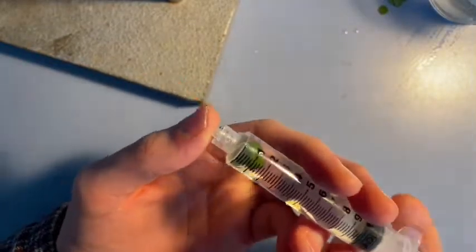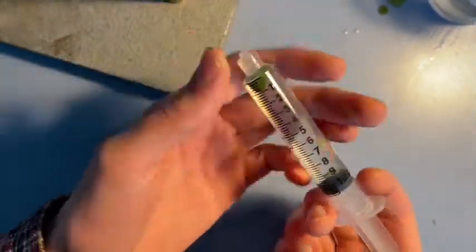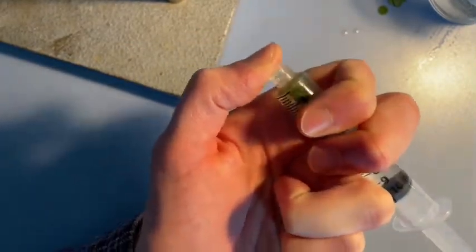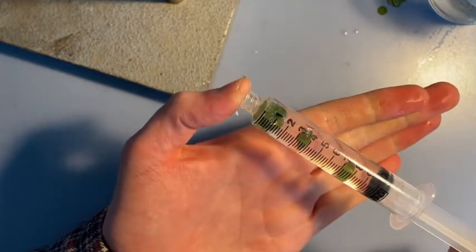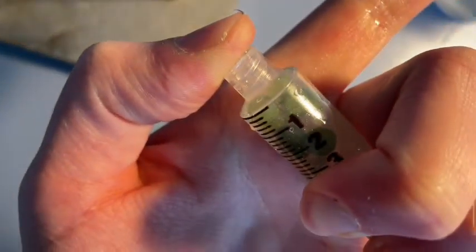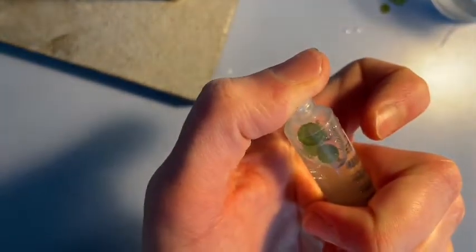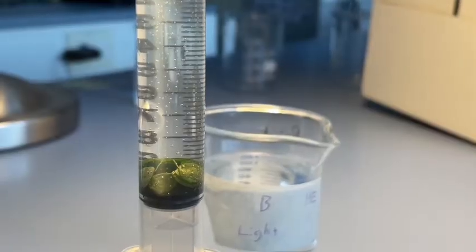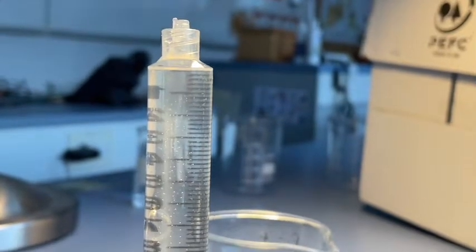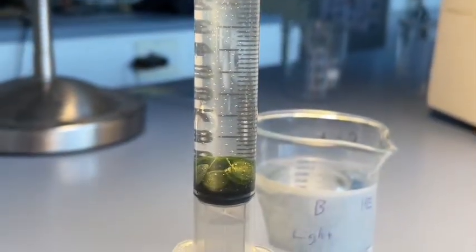In order to create a vacuum, I'm going to push out as much air as I can, and really I already have. Then I'm going to pull on this. As I put my thumb on the edge of the syringe and pull back, that is creating a vacuum right there and sucking the air out of the leaves. What'll happen is they start to float to the bottom, so they've lost those little air pockets. I might have to do this a couple times to get rid of all of the air. So vacuum it up, and then release. Now all of my leaves have successfully sunk to the bottom. None are at the top. The only way they would get to the top is if they got more air bubbles, which would come from producing oxygen gas from photosynthesis.